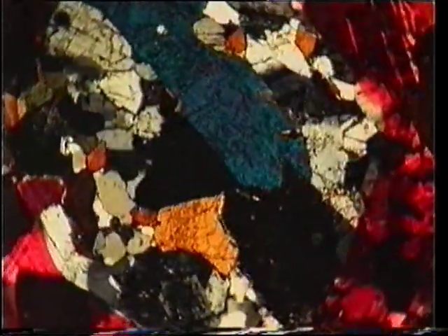Check the relief, colour, pleochroism, crystal form and interference colours. The unknown mineral has high relief and moderate birefringence and is pleochroic from yellow to green.